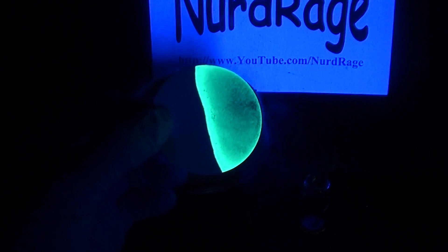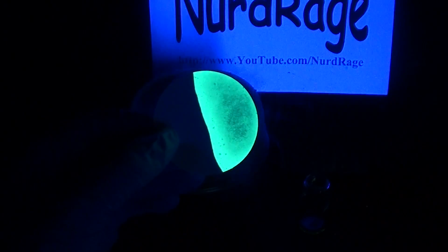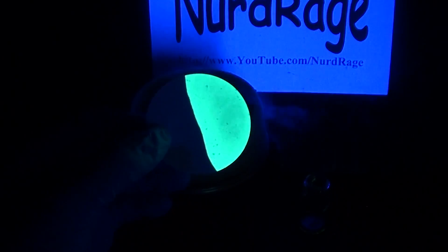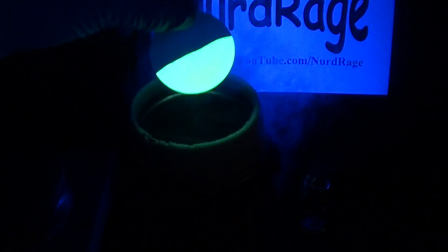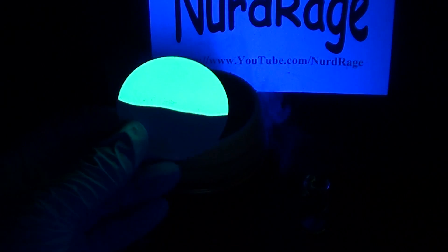Just a little more — there we go. Nice bright green bis-pyridine copper iodide. Now freezing it doesn't change its fluorescence very much, but let's go in the opposite direction and heat it up.